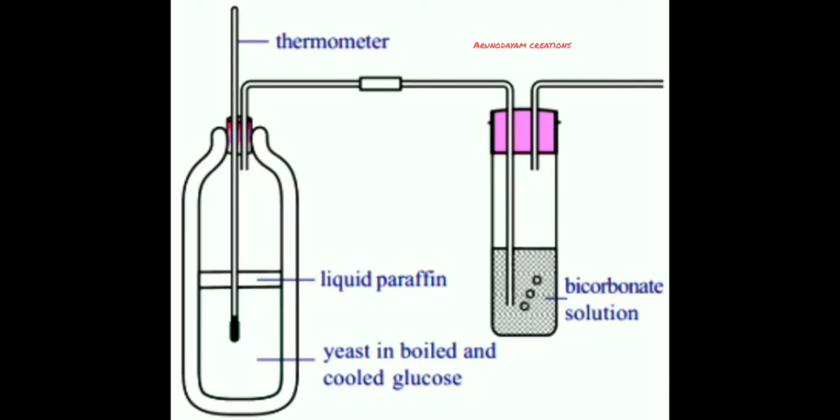So by heating and cooling glucose solution, the dissolved oxygen present in it will get removed. And remember one thing, we should not shake glucose solution after that. Why? Because if we shake it, atmospheric oxygen will again enter into glucose solution.